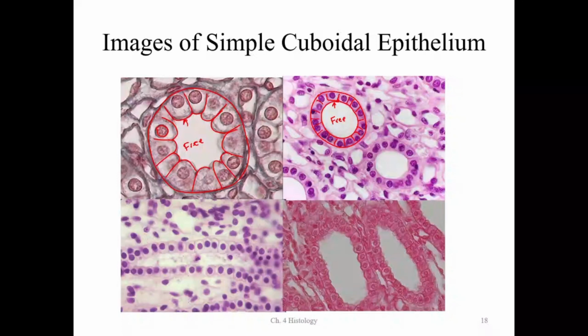Same thing goes here. Free surface. You can see the shape of the cells. Now, that's looking at the end. Same thing here.